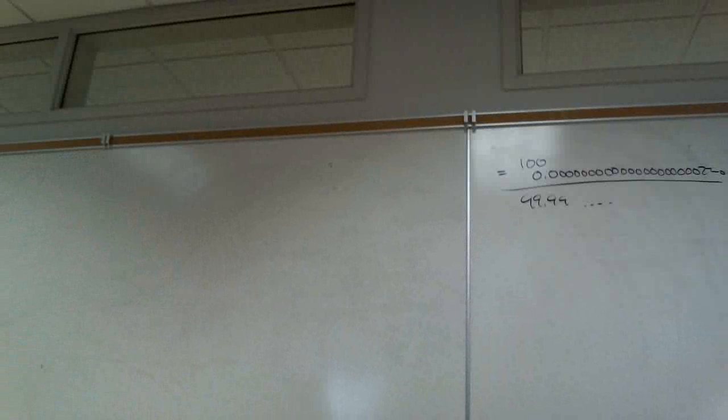And so we're just going to get familiar with the pH meter, the pH probe, in preparation for Tuesday's titration lab. On Tuesday we should come in, quickly calibrate it, and get everything set up, ready for the titration. This is a very time-consuming lab, Tuesday. And so what you're going to do is set up the pH meter, calibrate it with a pH 4 and a pH 7 buffer.